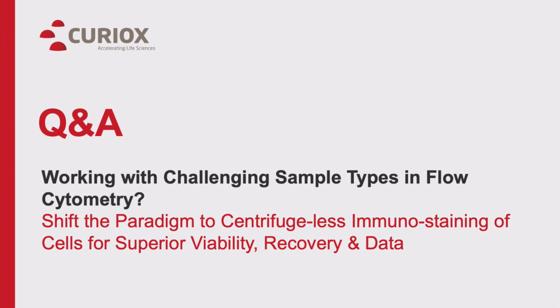I would say if there was anything that could happen, again, if you're working in solid tissue samples and you don't put them through a cell strainer prior to putting them onto the laminar wash system, you might get some clogging of the nozzles, but that can be easily averted by putting a priming system in there. But so far we have not had any issues with the system at all.